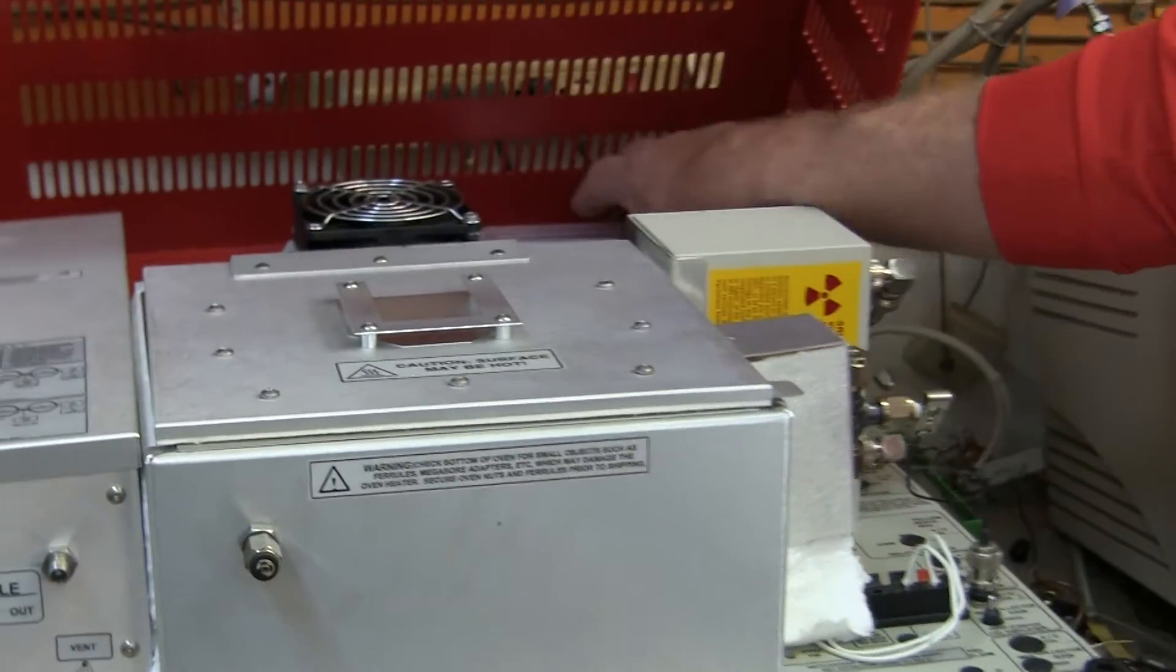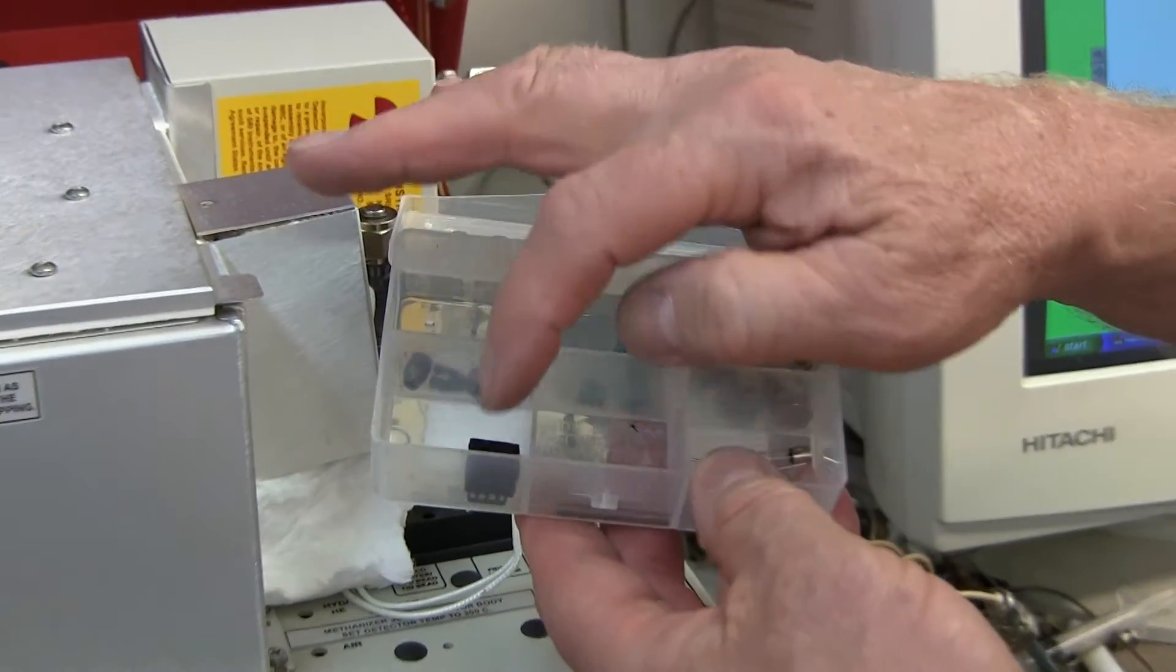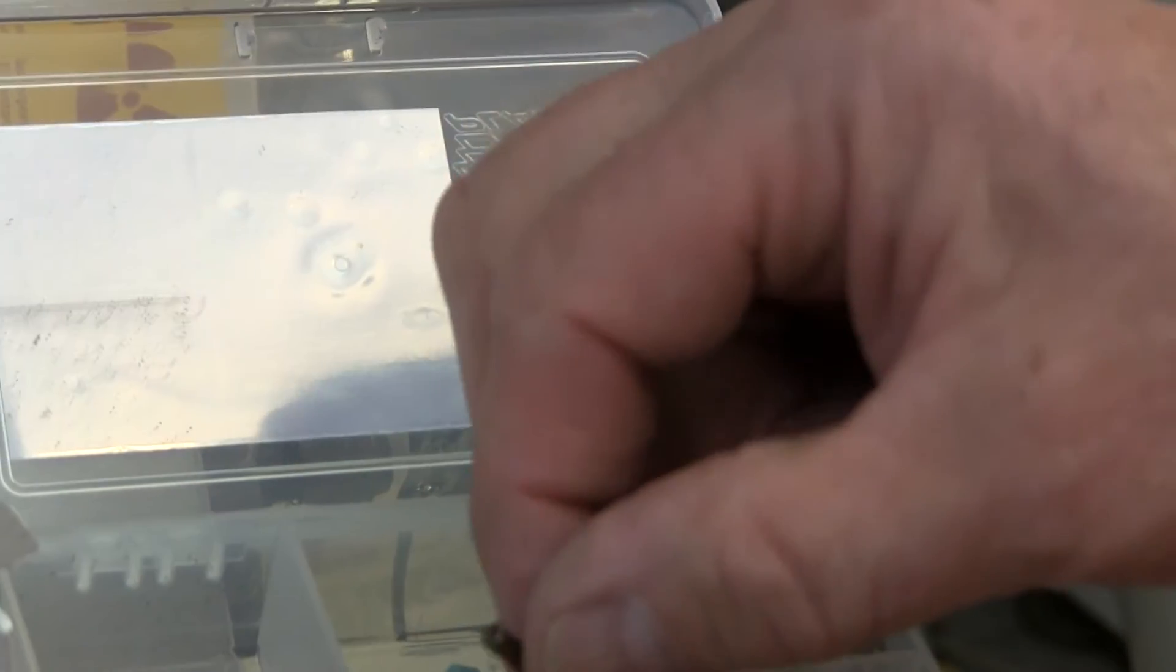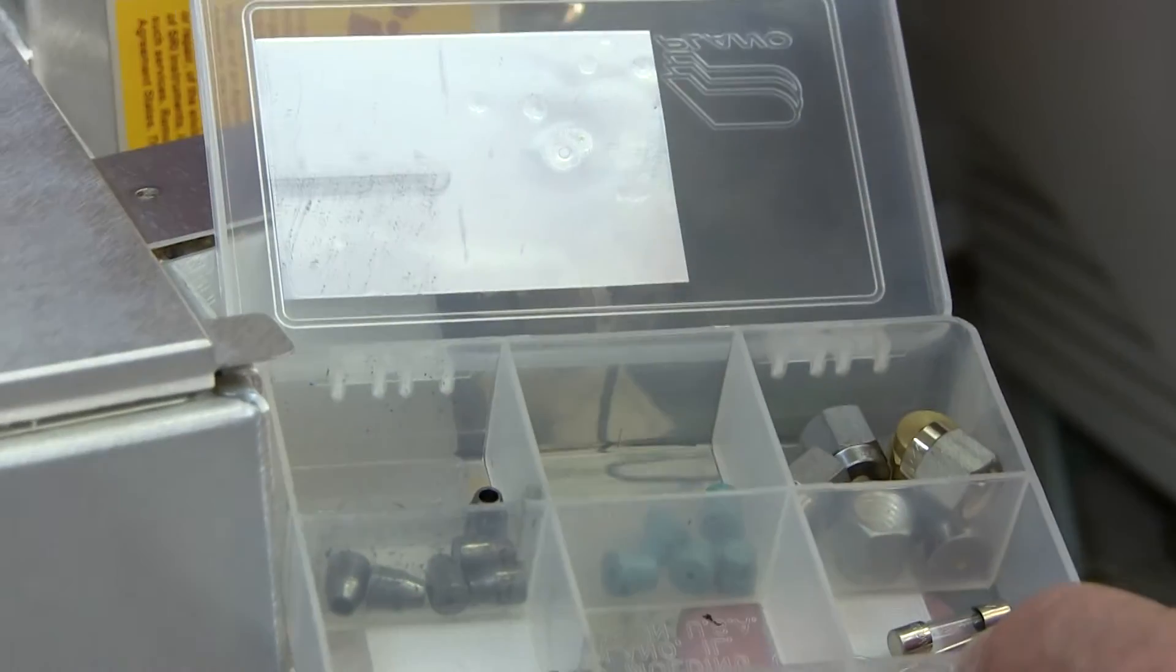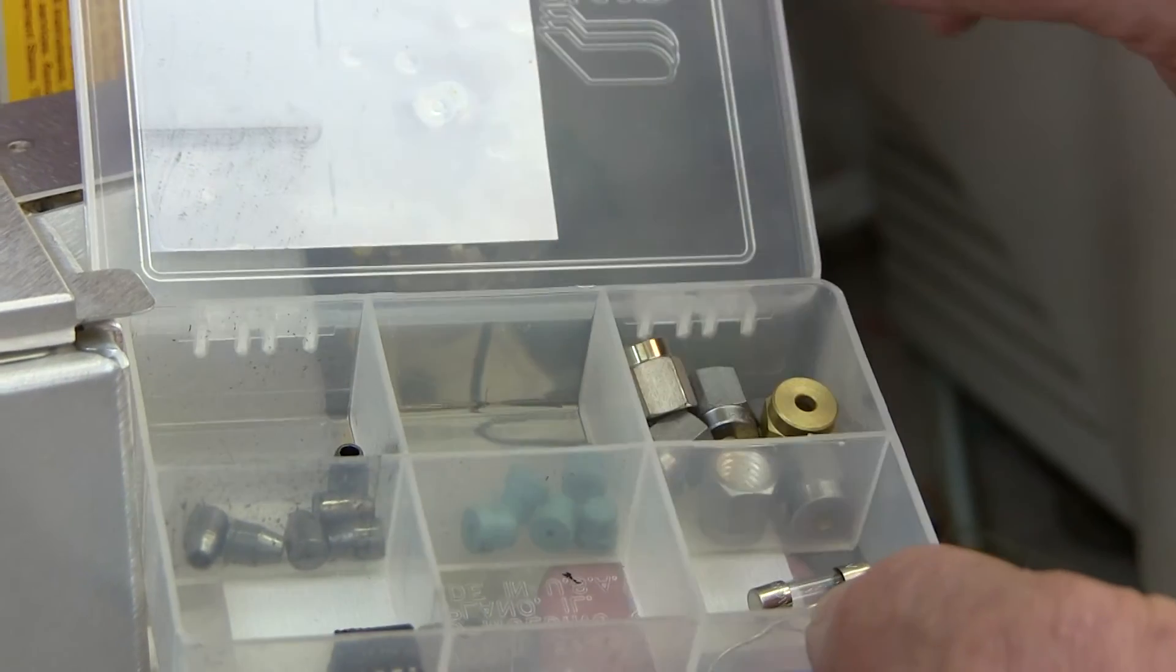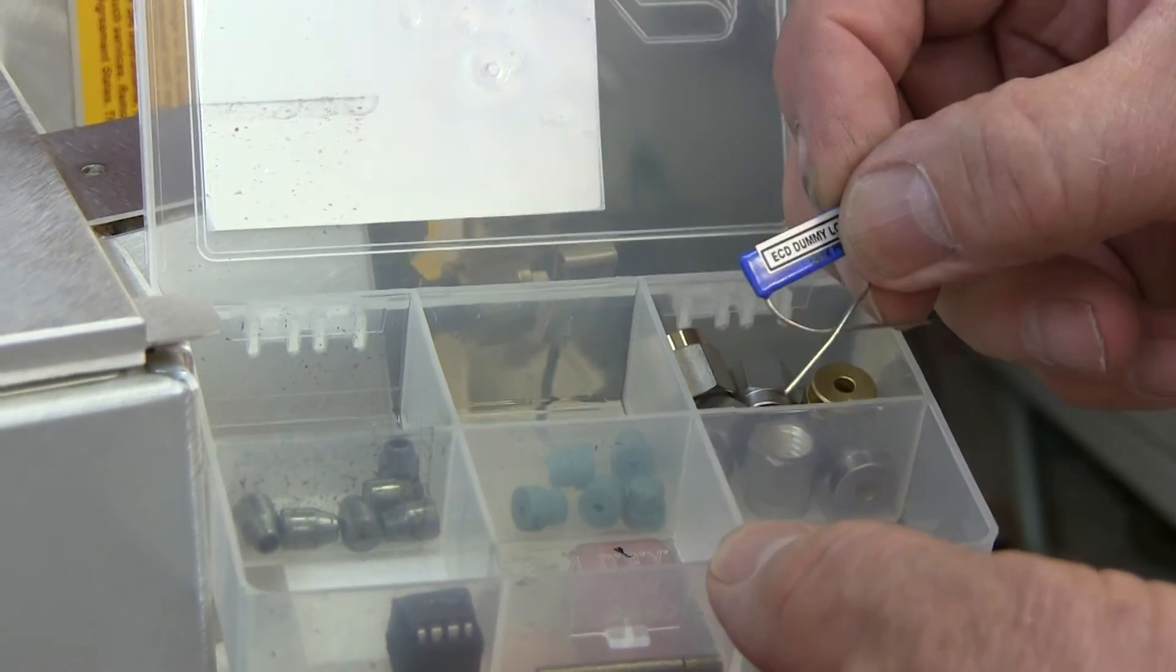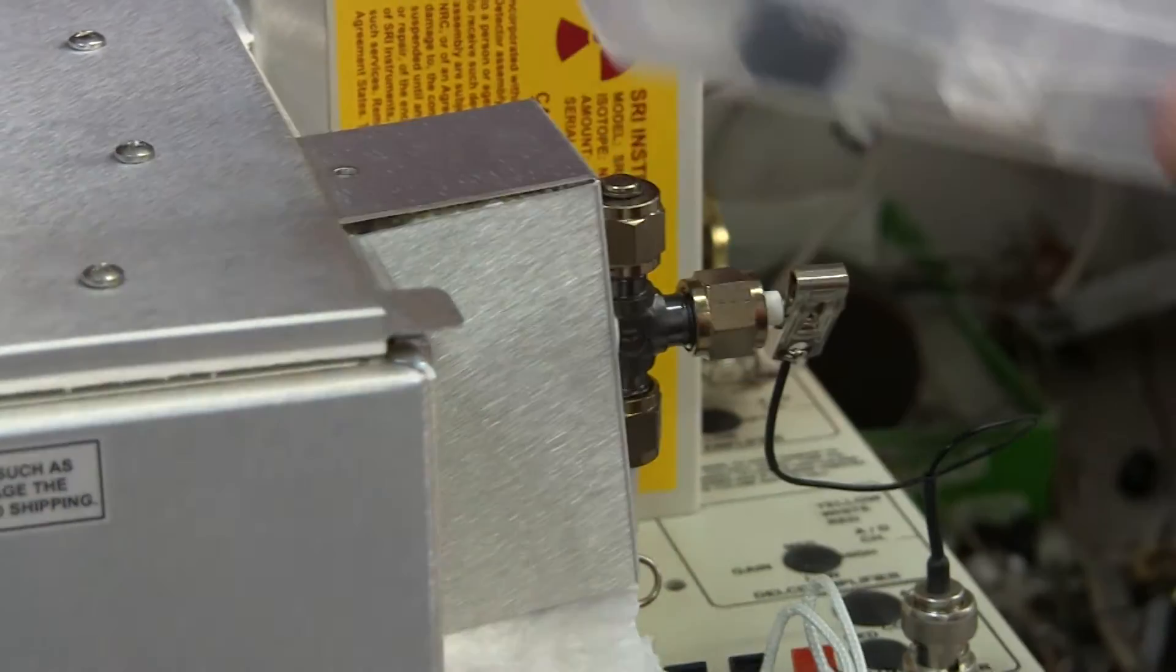In the back of the GC, there's a little parts box. This contains some common replacement parts: extra graphite ferrules, an extra chip. In case the amplifier chip has a problem, you can replace it. You have a little adapter so that you can make a syringe injection onto your column. There are a variety of septa, replacement septa. These septa last for thousands of injections if you don't over tighten them. But eventually they need to be replaced. The part number to replace them is right here on the lid. You have some extra nuts and ferrules. And in this case, because the GC has an electron capture detector, there's a little test resistor that enables you to test the electronics of the GC and verify that the electronics are working properly.